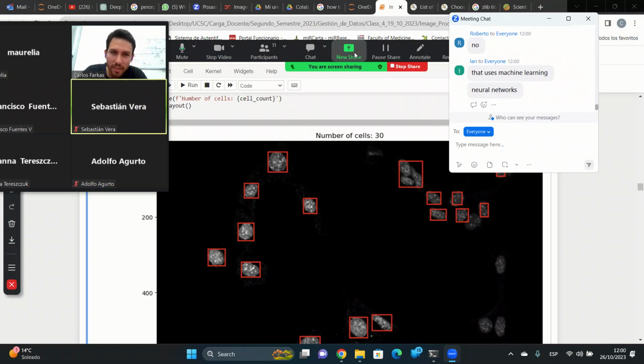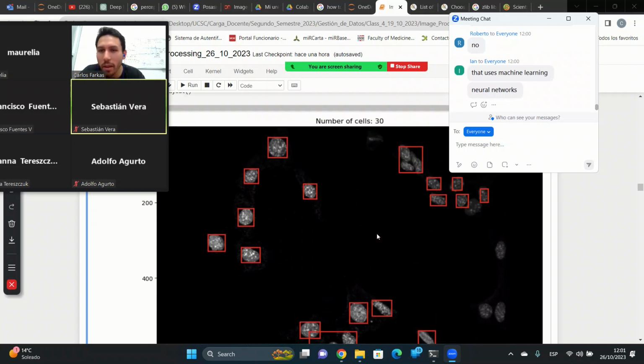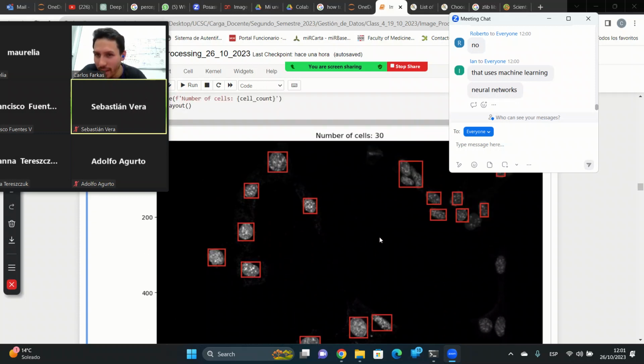Well, sometimes to count nuclei, it's very easy by hand. We can count it here by hand by doing click, click, click, click, click, click. But what if we have like 1,000 set stacks, or we need to count a lot? That's a problem. And sometimes it happens more than you think. Even with your own data, you might think you have not so much data, but actually you have a lot. Believe me on that. And it's usually good to benchmark different methods.